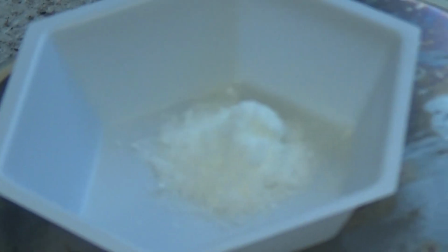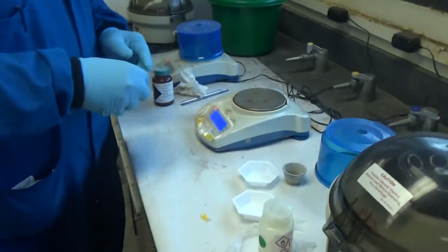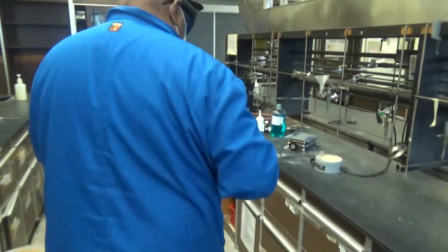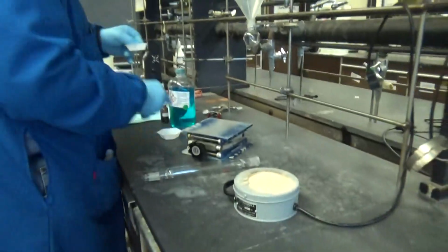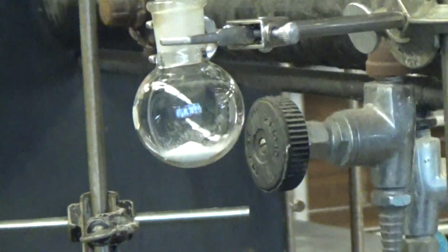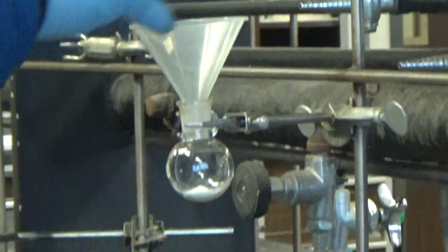This one also looks like a sugary white solid. A lot of organic molecules do. So you're just going to put them into the funnel and dump them into the round bottom flask. That's pretty easy.